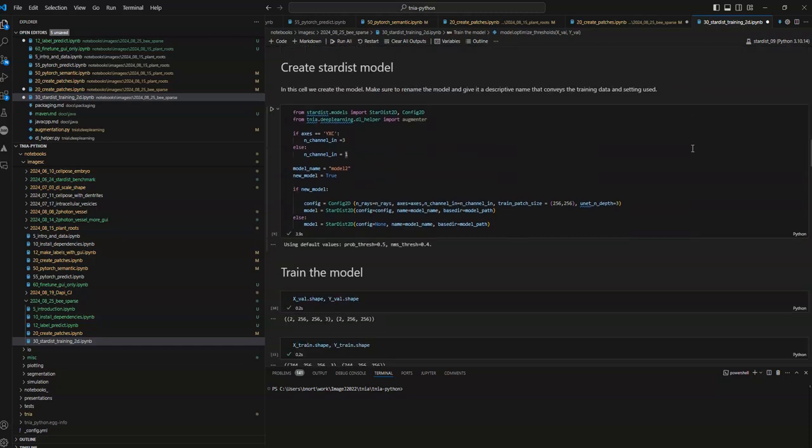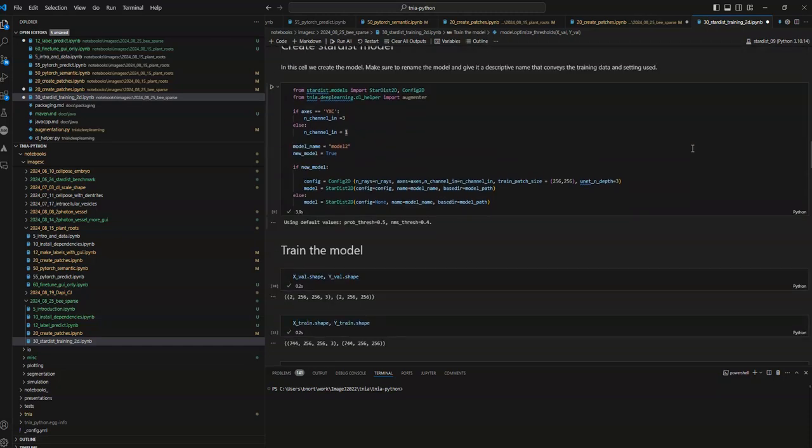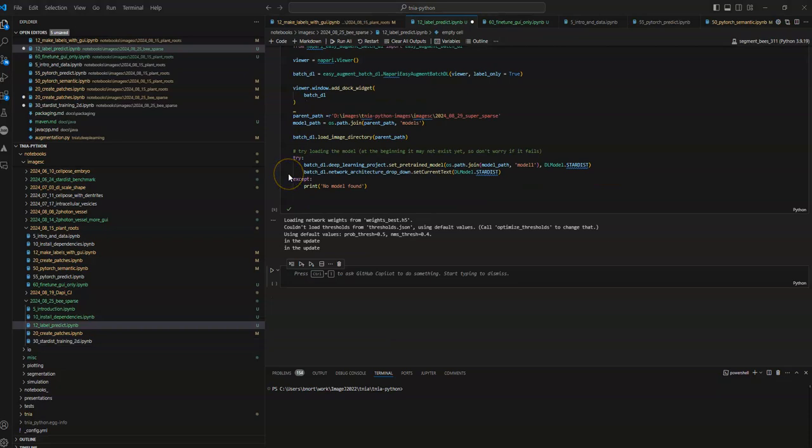Now, one thing that I've been running into, I've been having some speed problems on Windows. Maybe that's something I should bring up in a thread again. But what I'm going to do is actually stop the video, train this on Linux, and come back. Okay, so I just went ahead and trained a model on a couple of the sparse label sets. This is throwing a lot out there in this video, so hopefully in the next few weeks I'll do some better training videos on some of this stuff if I have time.